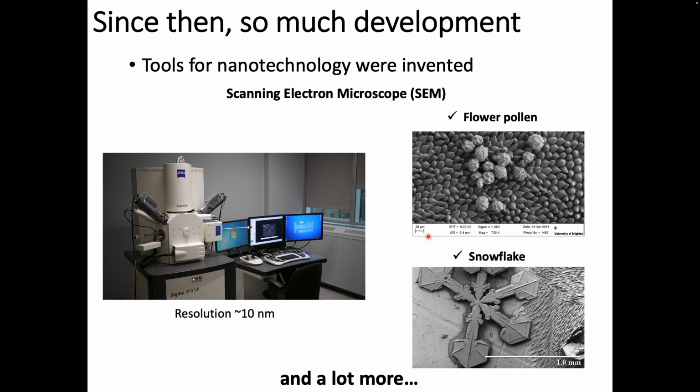So electrons are also a kind of small object, right? If there are many air molecules, they bounce off the air molecules, and then you cannot really get high resolution. That is why, when you learn how to operate the SEM, you are asked to wait until the vacuum reaches a certain level. Obviously lower vacuum pressure is better, but that takes too long. So you just wait until the vacuum reaches a certain level, and then they guarantee some level of resolution. We will also cover that later, like how electrons behave, etc.